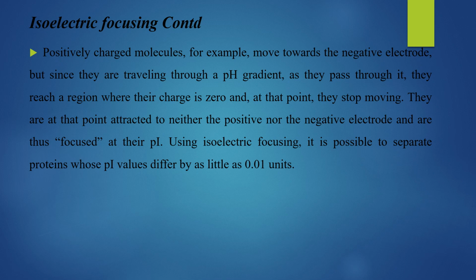Using isoelectric focusing, it is possible to separate proteins whose pI values differ by as little as 0.01 units.